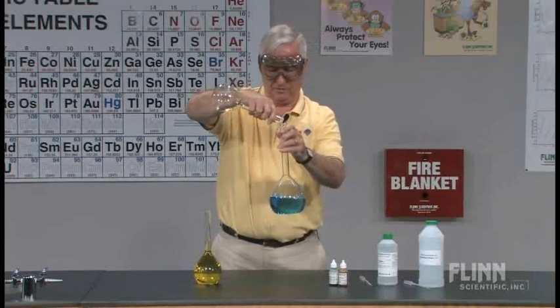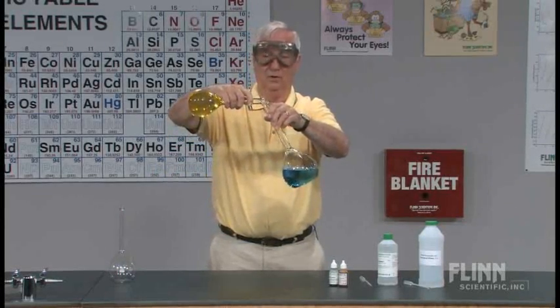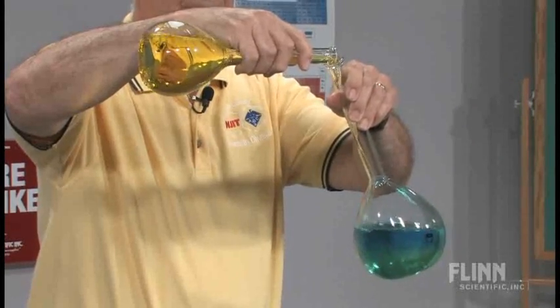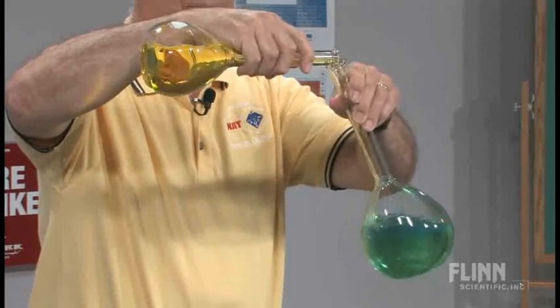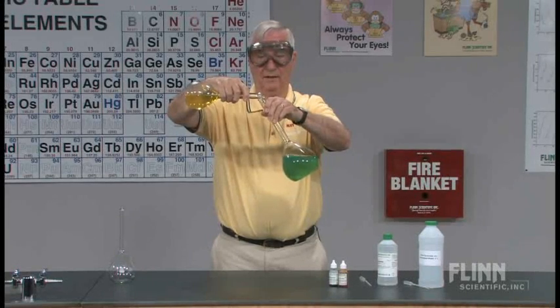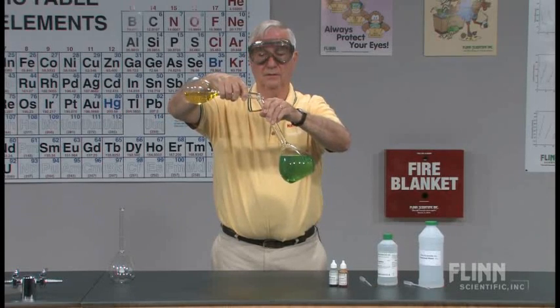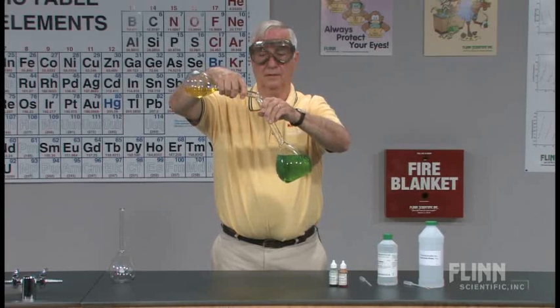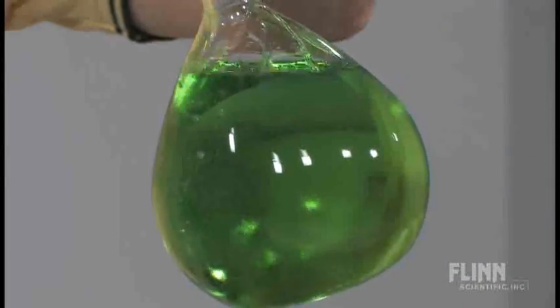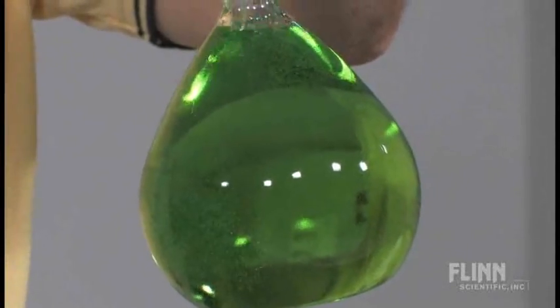We now have 500 milliliters of alcohol in our flask and I am now going to add the water — and of course we know what's going to happen when yellow meets blue. Art lesson here. We can see the mixing taking place readily. I put the alcohol in first because the more dense water mixes more freely with the alcohol. We can see the evidence of the mixing very clearly because of the waves, the Schlieren effect that occurs when the two liquids mix.